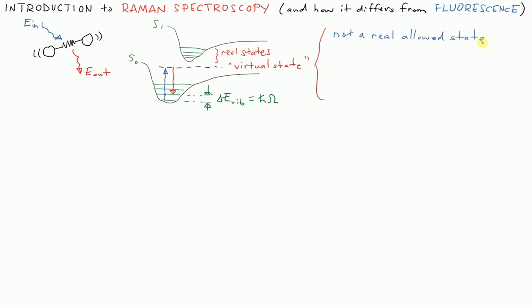And we can then look at this energy gap between the virtual state and the nearest actual state that's there. And this diagram looks like it's about that much energy. And we can call that the energy of detuning. There's a delta E of detuning there.